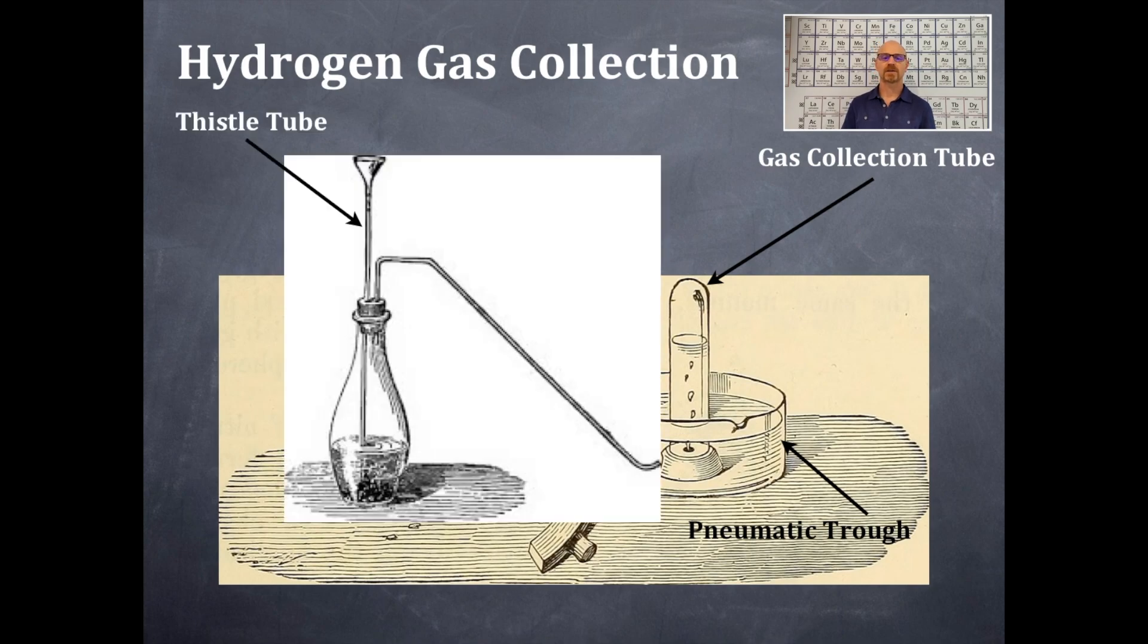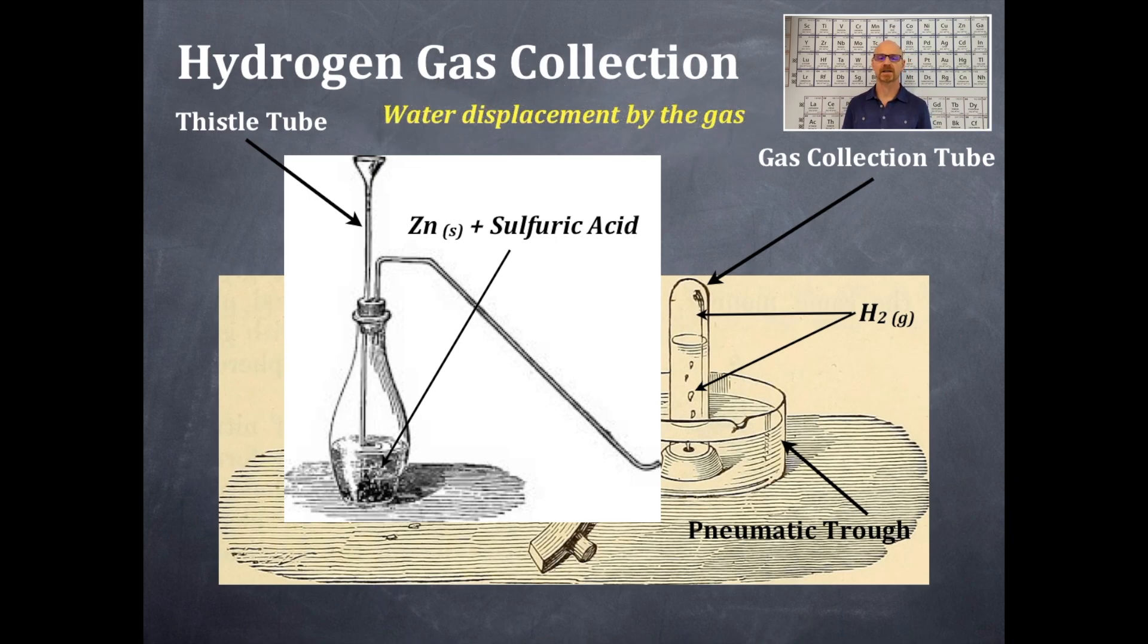Here's another way you can do this. Take a flask, put some zinc and sulfuric acid in there, and it's also attached to this pneumatic trough and inverted gas collection tube. The hydrogen gas is being generated, and you can see it at the top of the gas collection tube. This is water displacement by the gas, so it's displacing the water and pushing it out while the gas fills it up.